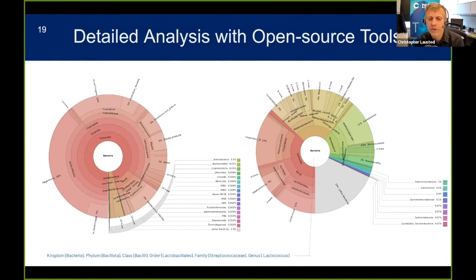Some students went beyond just the bacterial databases. Some students also looked at eukaryotic databases, so that would include yeast and multicellular organisms. They found that pet samples might often contain fly DNA.